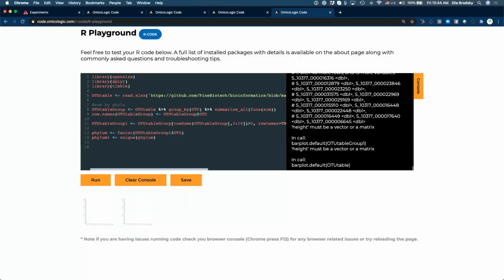For all samples, instead of a table, we need a matrix. So let's call this a data frame, and we'll just call this as matrix. And we need to take OTU table group 1. And we need to remove the first column, which is 1.